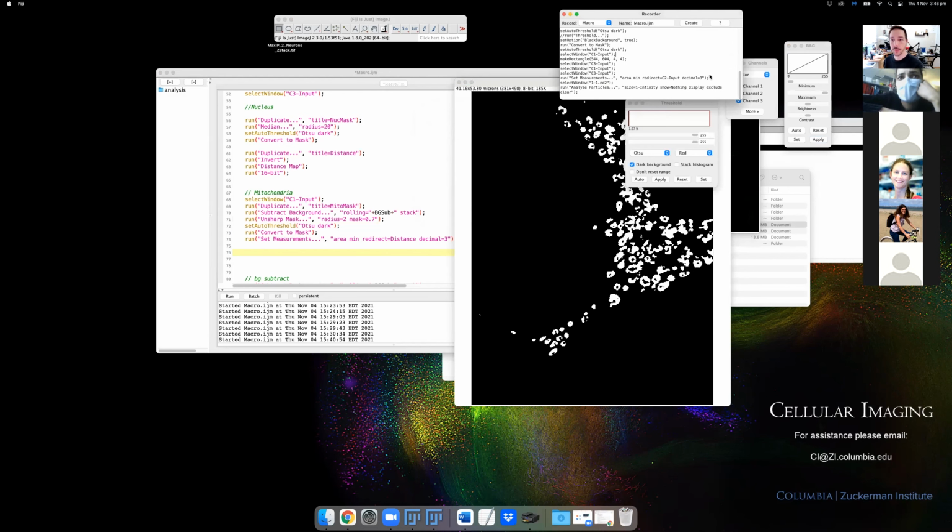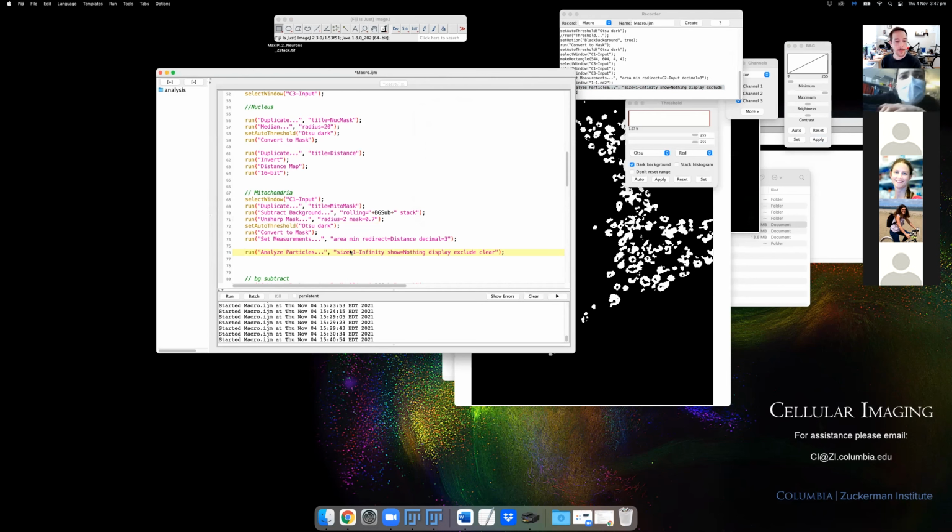It's complaining, but that doesn't matter. We've still got this command. And we want to, yeah, we're redirecting it. This is fine. Okay, cool. So we've got this kind of working. I know we're sort of doing this a little bit quicker now, but hopefully it's making sense based on what we've already done on the previous image.